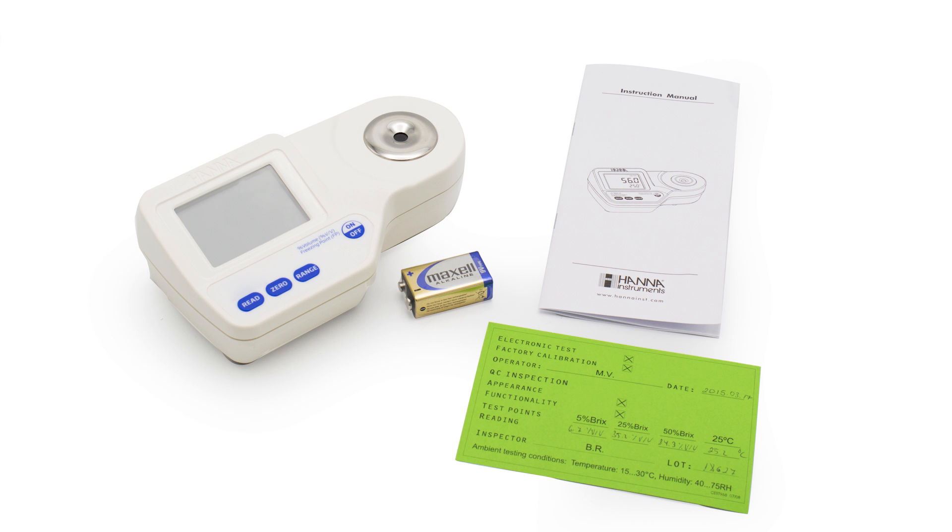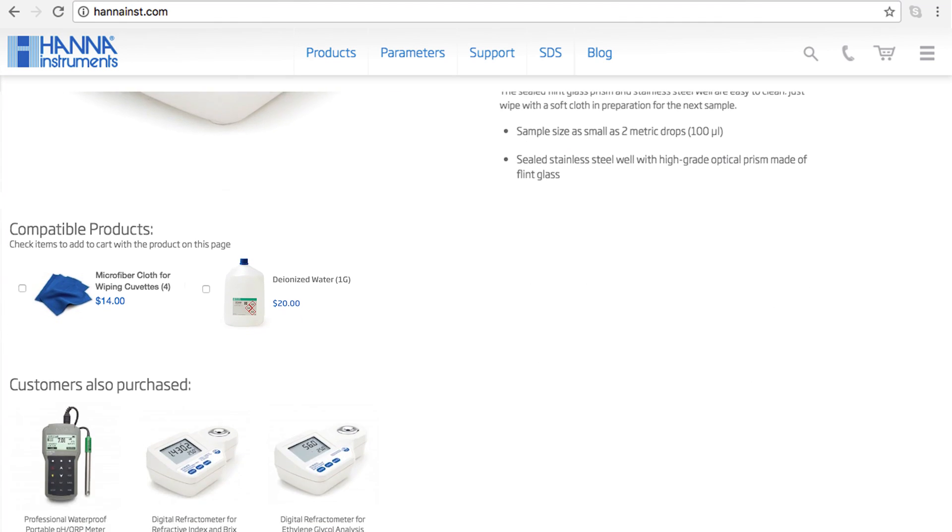Your meter includes one 9-volt battery and the instruction manual. I recommend you check out our compatible products on our website. For this meter, I recommend our HI731-318 microfiber cloths and HI70436 deionized water.